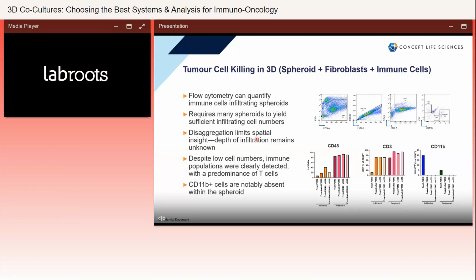When we were doing that with this single sphere system, what we were finding is to get anything meaningful, we would need to incorporate lots of spheres just to get enough data to see what the immune cells were doing, because there were so few of them in the sphere itself. And one of the things we did notice was, actually, if we did pre-activate the PBMCs, they were able to get into the sphere. So obviously, they're happy, they're healthy. We did a viability dye, and they were healthy. But relatively low numbers of them can enter, and the addition of anti-CD3 made no extra addition. But when we added fresh PBMCs and we activated those with anti-CD3, there was a greater proportion that were going in. Obviously, this has got no error bars because essentially we had to incorporate so many of the spheres together. We actually lost our N number, but the vast majority of those that do enter are T cells. So the greatest majority of those are T cells.